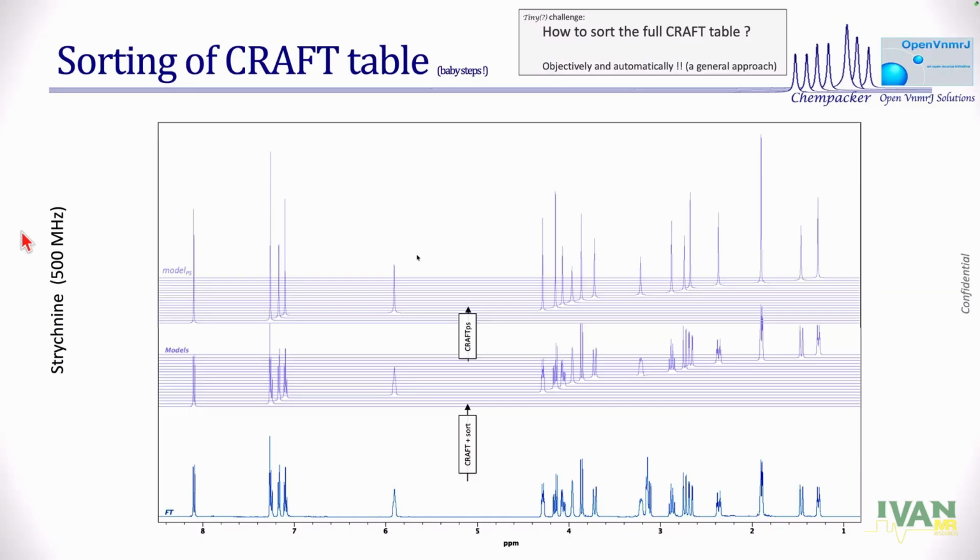Except I cheated. I cheated in the sense that there are two cheats I did that you probably noticed or not. One of them is here, a chloroform overlapped resonance. There's a chloroform. I said, okay, I don't know how to separate that out. It is buried in there. I don't want to see it. I just simply put two cursors. I will accept that chloroform into that pure shift. I made a judgment call.